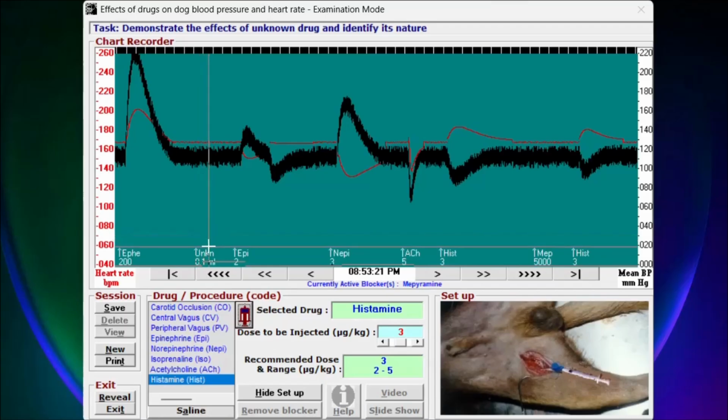इसका मतलब ये तभी हो सकता है जब ये unknown ड्रग भी H1 ब्लॉकर है। अगर suppose ये unknown ड्रग H2 ब्लॉकर होता, that is सिमेटिडीन होता, suppose ये, so in that case हमने H2 तो पहले ही ब्लॉक कर दिया है, अब जब हमने मेपाइरामिन दिया तब H1 भी ब्लॉक कर दिया है। तो in that case when we give histamine we will get no response, right, but यहाँ पे हमें still response मिल रहा है। इसका मतलब क्या है कि H2 receptors are still active, and that can be only possible when this unknown drug and mepyramine both are H1 blockers.